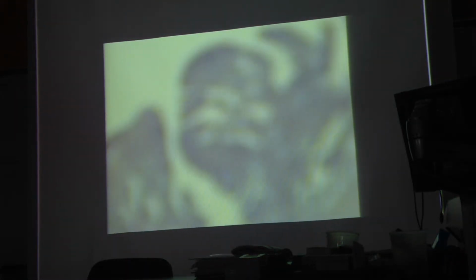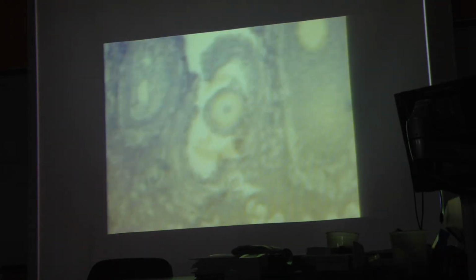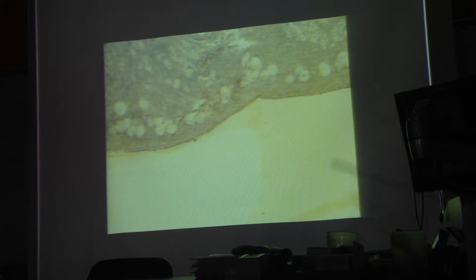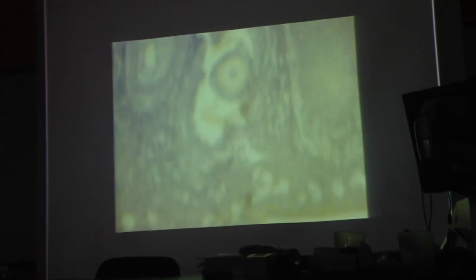Okay, this next slide is also ovary, but with a little bit of the oviduct attached to it, which is what this is. The ovary is right by it. Here in the section through the ovary, again, you're going to see the same stuff you saw in the previous slide. A lot of primordial follicles here, more toward the outside of the cortex. Then you see some secondary follicles.